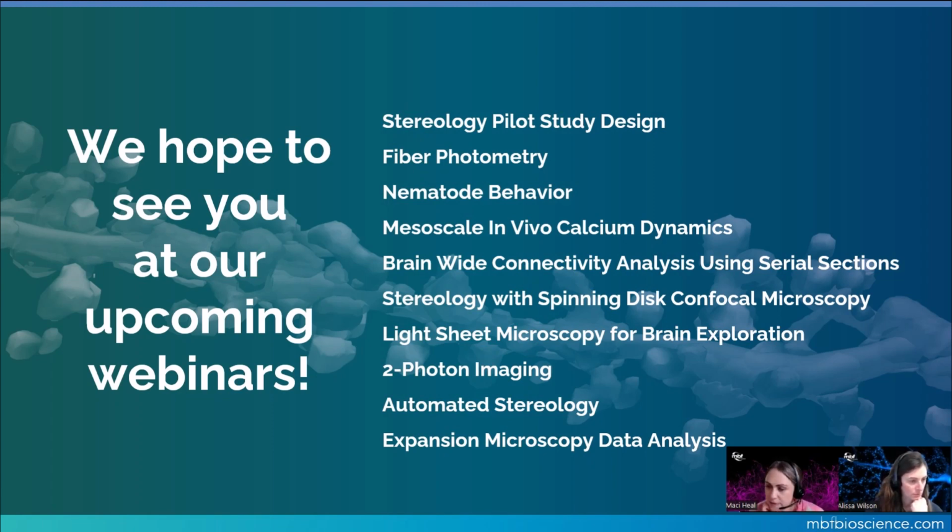Some questions about the Explorer functionality. Function to calculate the nearest distance between an axon and a vessel. We do have a proximity analysis available, but we'd love to hear more about your specific needs for that.